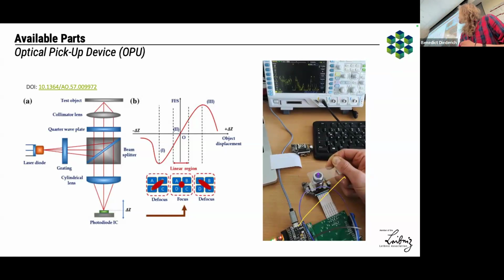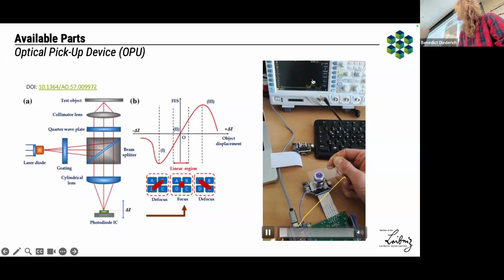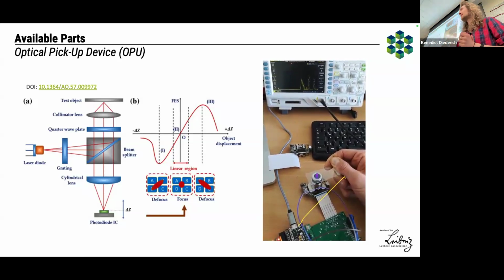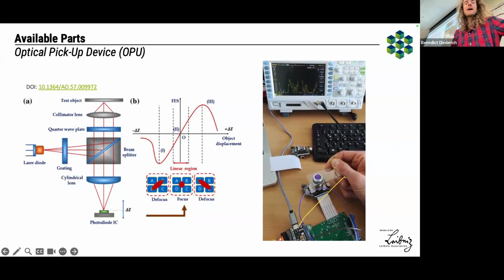And so, I mean, you could use that already as an autofocusing element for your microscope, which we have brutally done here. So basically just placing a little objective lens on top of this thing here. We read out information, and what you see here on the oscilloscope is basically the focus value. So if it goes up, then we're going up in the focus, and down, then it's going down. And this thing literally costs like €5 if you get that from eBay. It's mass scaled, pretty cool.